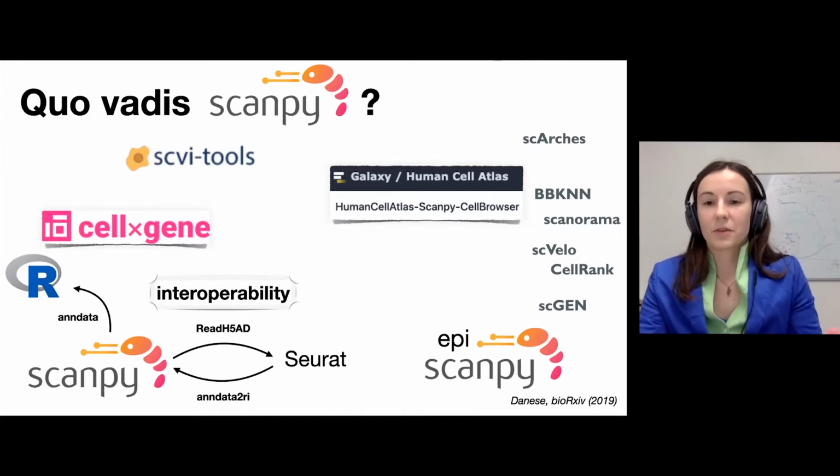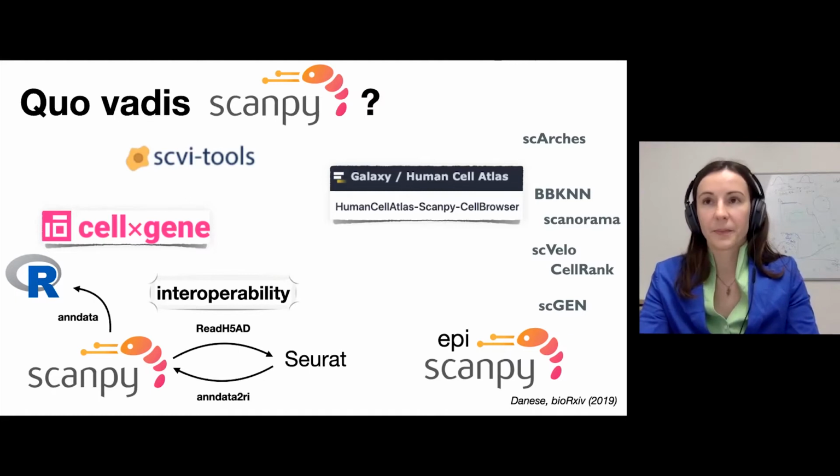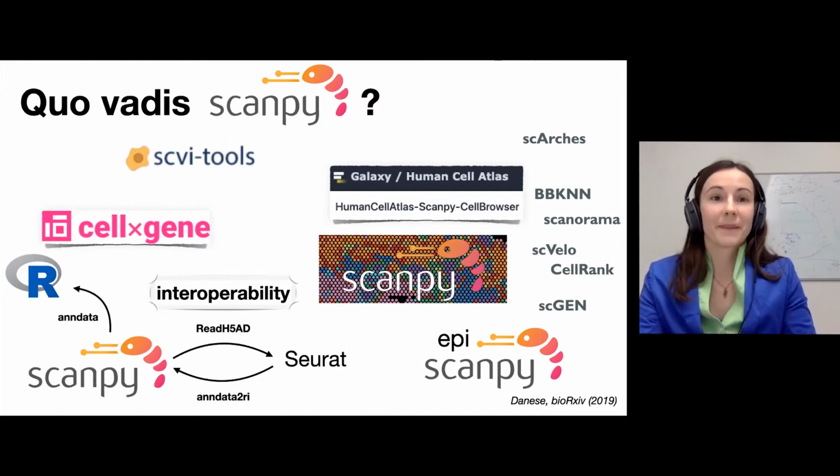Scanpy does not only do transcriptome, but also epigenetic marks with the EpiScanpy package that is developed also at the Institute of Computational Biology by Anna Danese as the lead author. And Scanpy goes spatial. What this is about Sergey will tell you more in a minute.